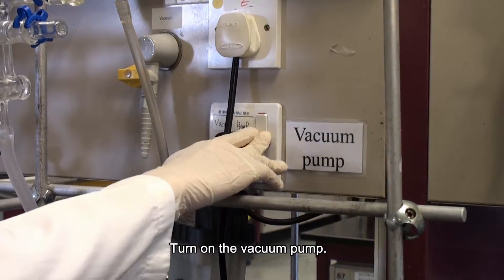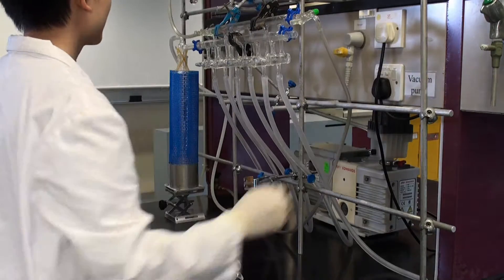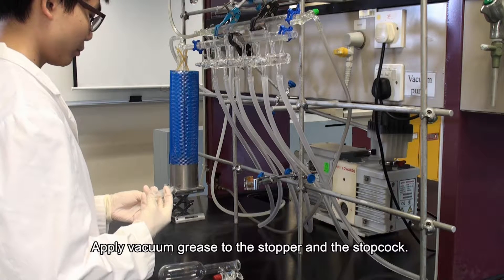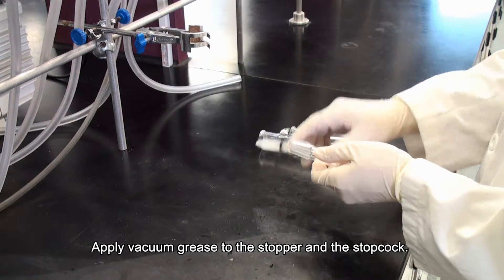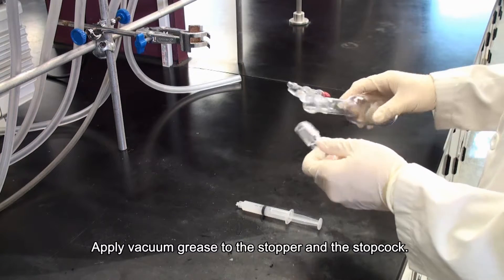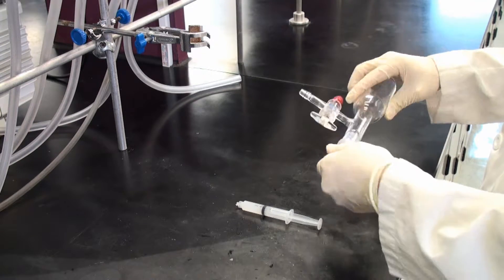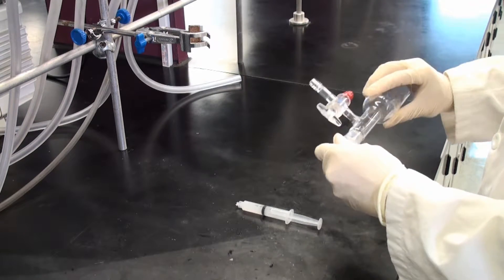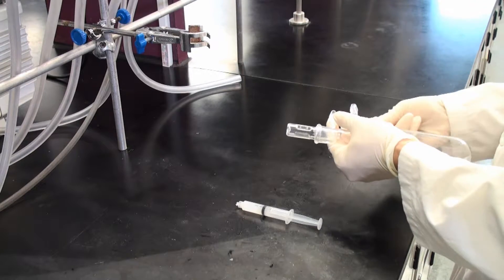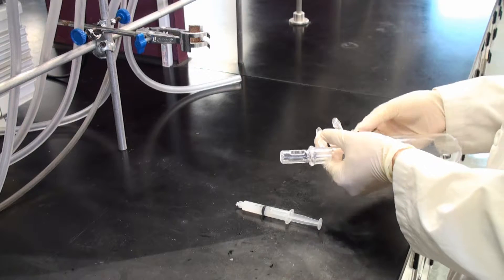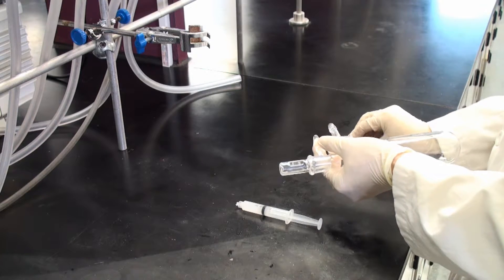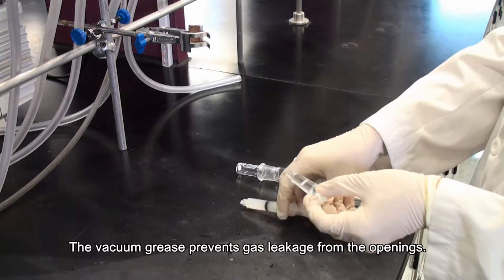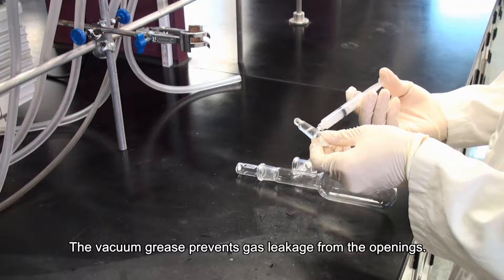Turn on the vacuum pump. Apply vacuum grease to the stopper and the stopcock. The vacuum grease prevents gas leakage from the openings.